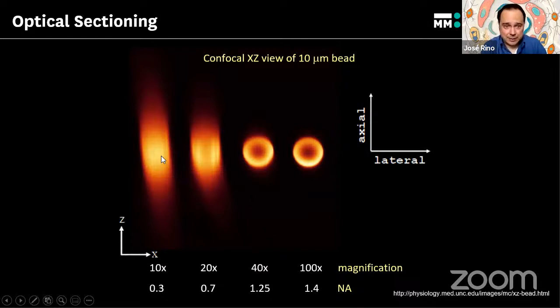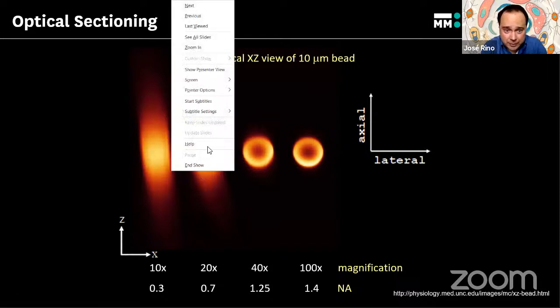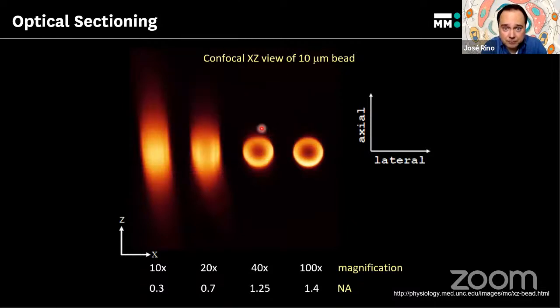So these are Z-stacks, these are XZ projections of a 10 micrometer bead.